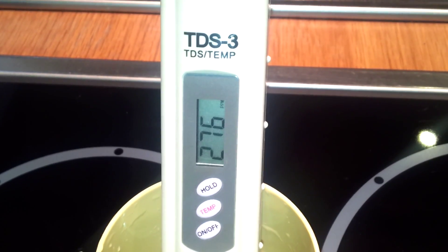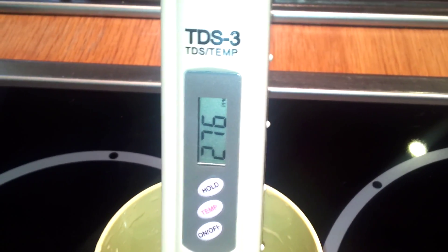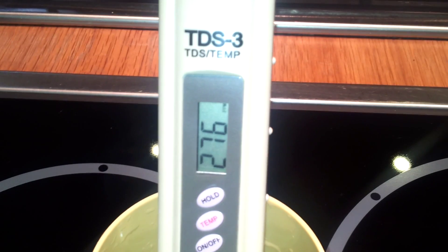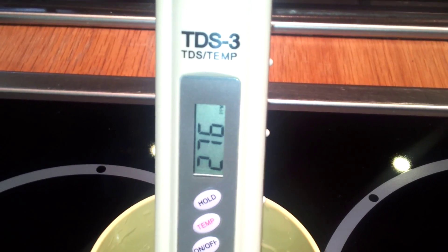276 — it might go a little bit higher yet. I think that's settling down, to be honest. 276 looks about as high as that's going to go, and that is for tap water.